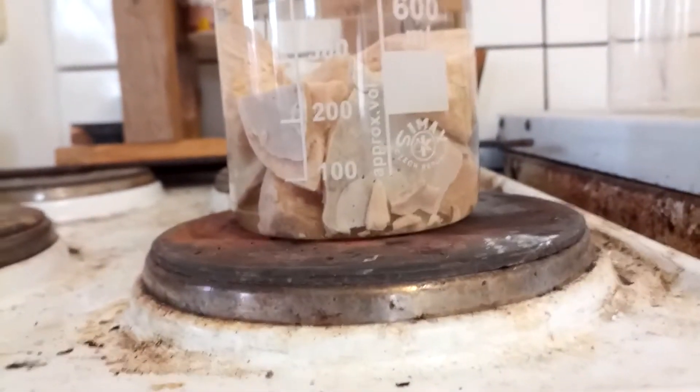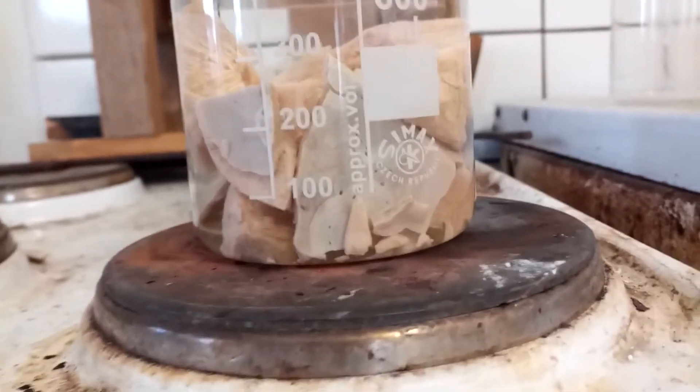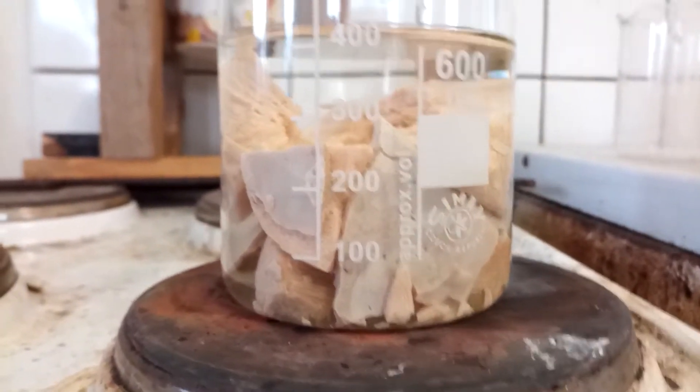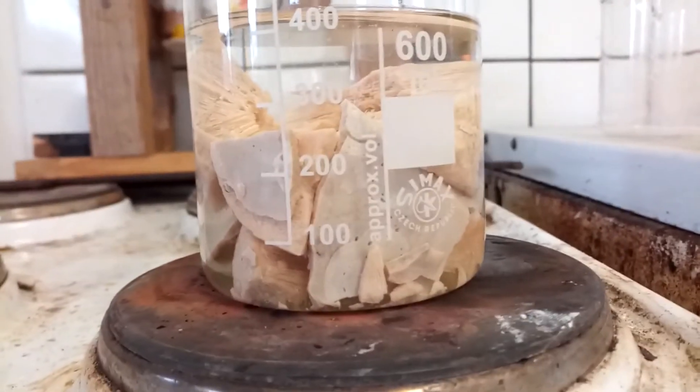When this is all dissolved — or at least everything that will dissolve — I will hot filter it to get rid of the cyanuric acid, which is insoluble in water. Then I'll basically just let the solution crystallize out the biuret.